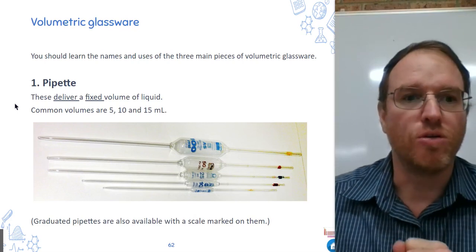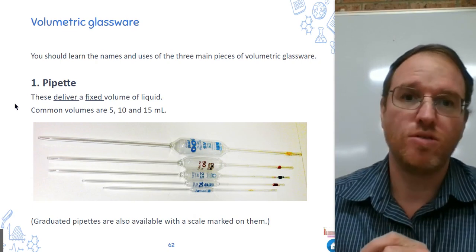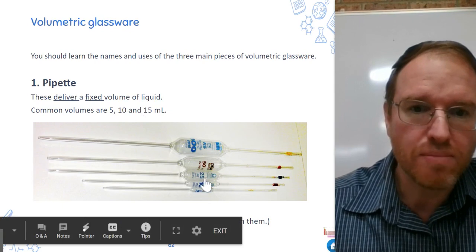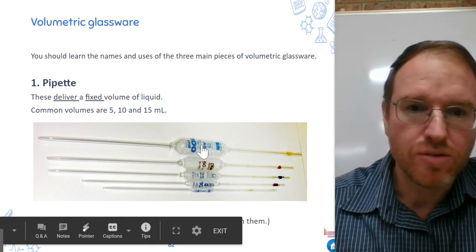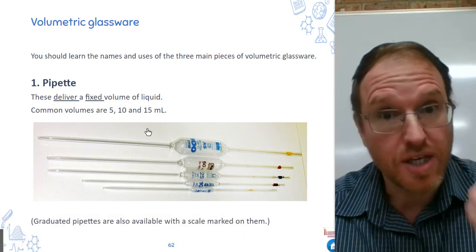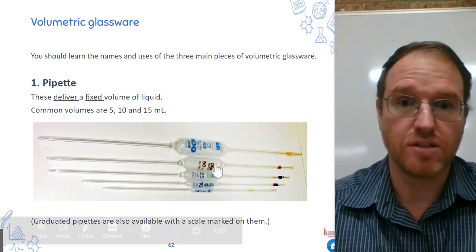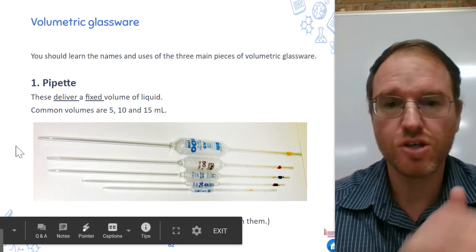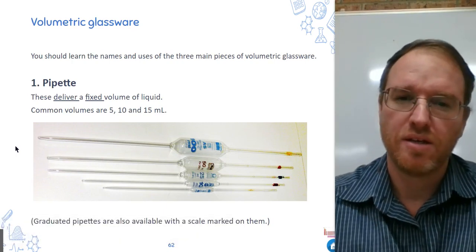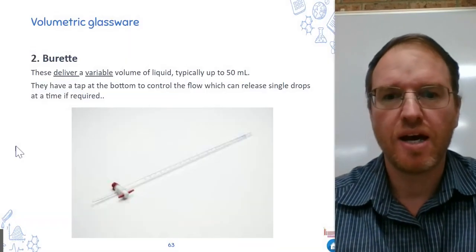And it's a fixed volume, meaning each pipette has a certain amount that you can transfer with it and you can't change that. So common volumes are 5, 10, 15, 25, 50, 100. You can see in the pictures here, they've got the numbers written on them. There's also a lot of other writing. Often they'll tell you which standards they meet, the percentage errors or the error in mLs, because that's important in volumetric analysis. That's why there's so much writing. So the pipette is the first one. There are graduated pipettes that have scales on the side, but we won't use those as much. So pipette, first one. Second one, a burette.